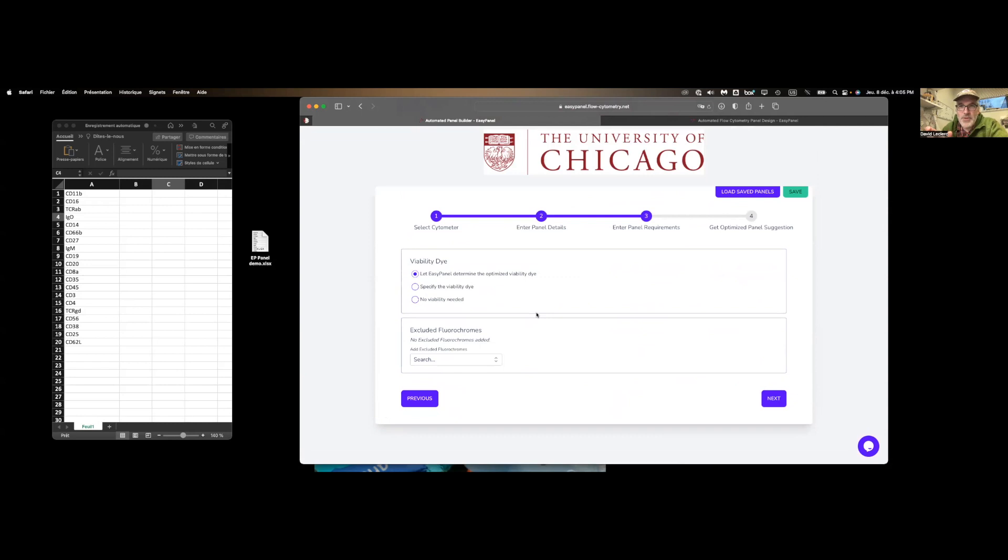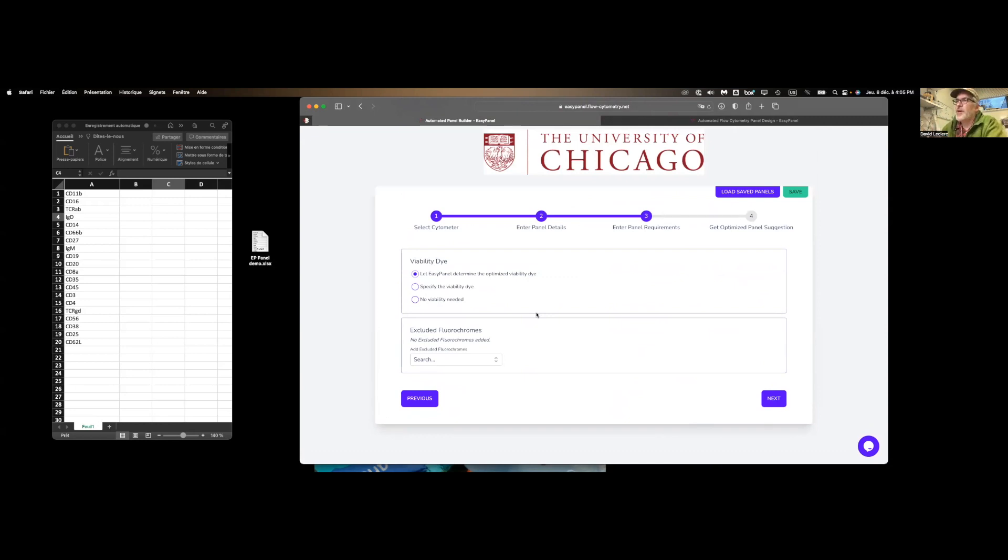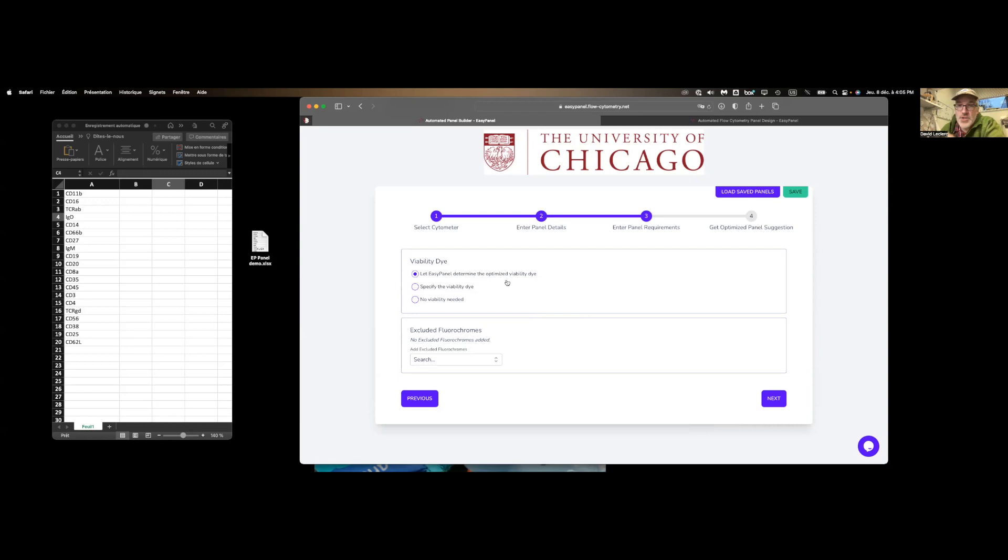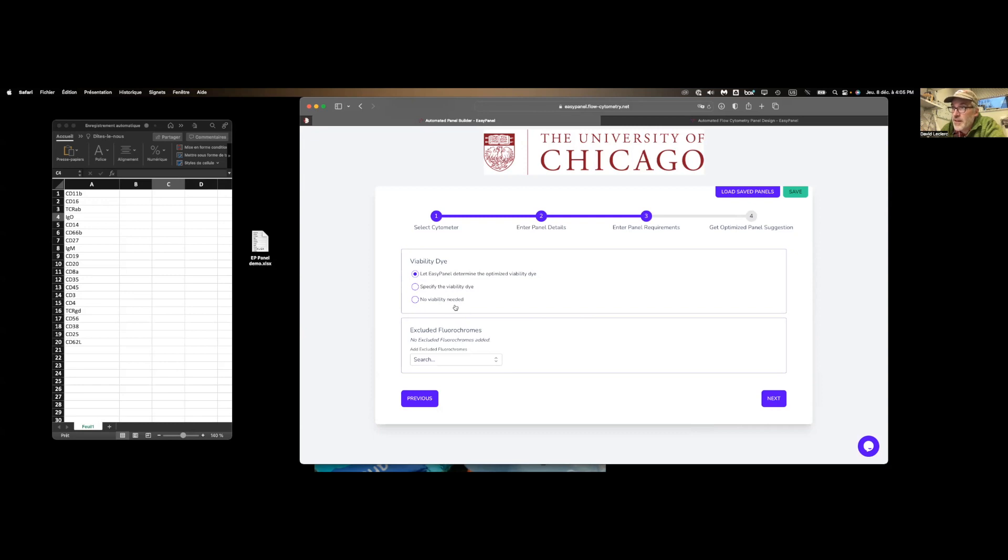Typically, the other tools will ask you now to pair the fluorophores with the markers, which is tedious. And this is basically the bulk of the work here. All that EasyPanel wants us to do is enter specific requirements that we might have regarding our viability dye. So we can either let it decide which is the best fit for the panel we are trying to build, or if we have one we really want, we can enter that here. Do not run your panels without viability dyes. Don't click on that third option here. Please.